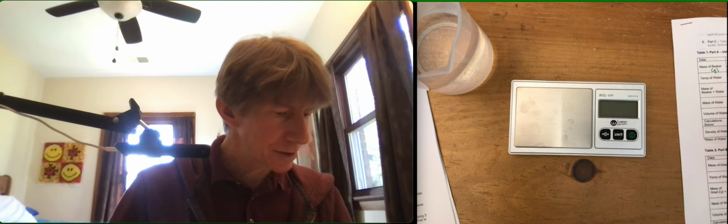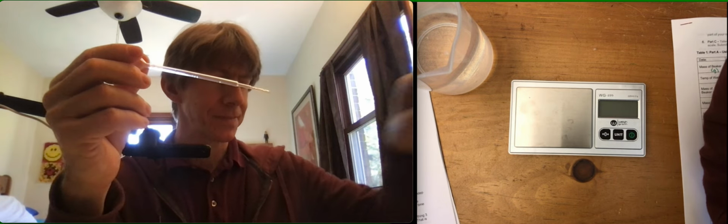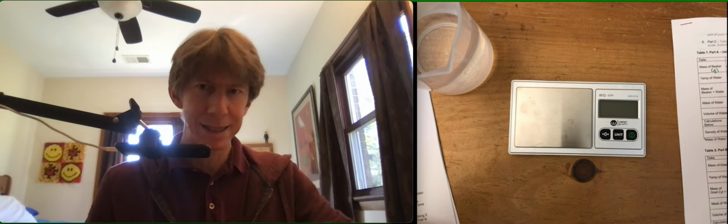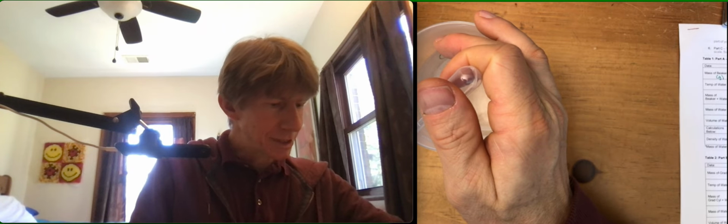Record the temperature, good. Condition the pipette with distilled water. So what that looks like is I've got my pipette. I've got my waste beaker. I am gonna move my scale a little bit out of the way. I think it's been shown to be pretty reproducible. So I've got my pipette here. I'm going to condition it, which means rinse the pipette 3 times with distilled water.